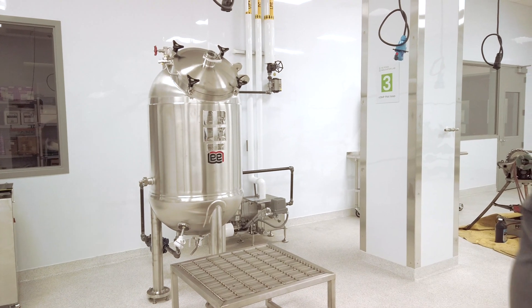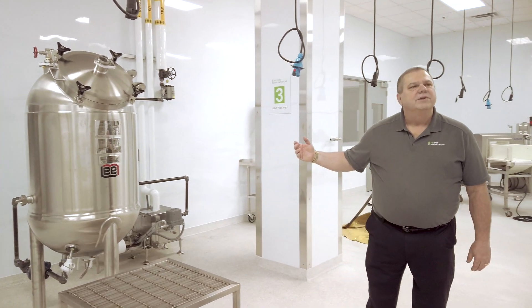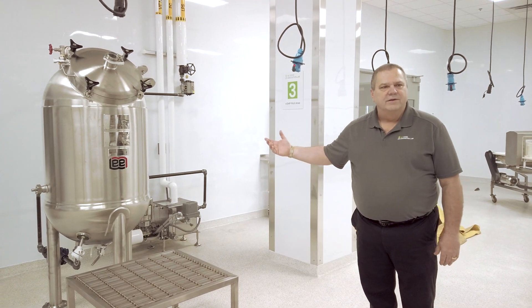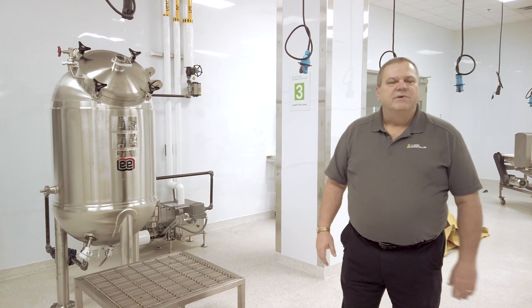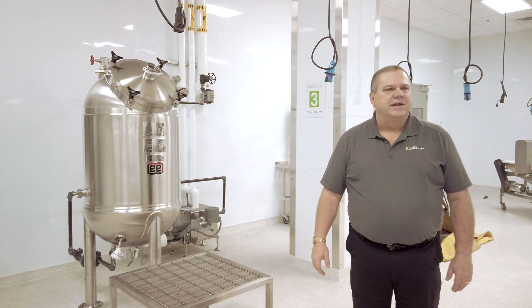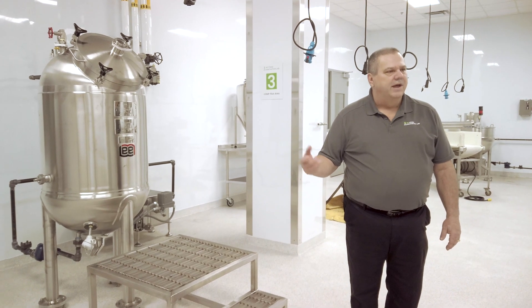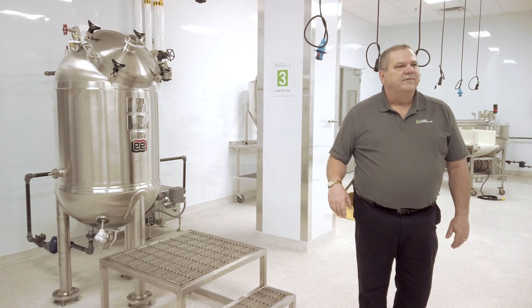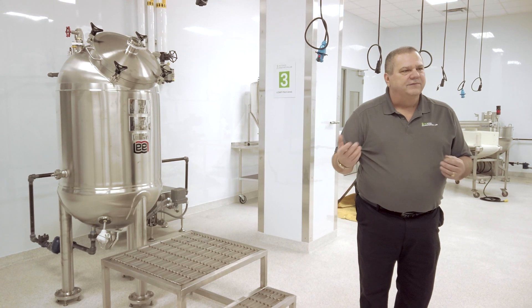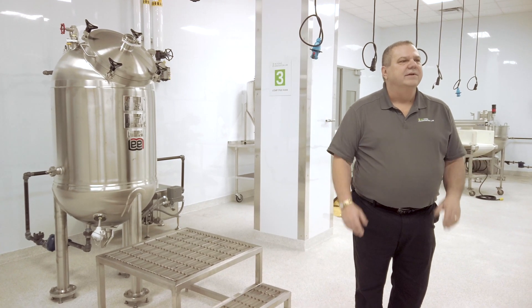Another piece of equipment we have in our facility is a 50-gallon vacuum pan processor, which allows us to do things like jams and jellies and condensed soups — it's a great way to remove water under vacuum. All products have to be packaged, and we have a number of different packaging configurations: a bag-and-box filler for half-gallon to three-gallon packages, a piston pump filler for viscous things like nut butters, frostings, and icings, a small powder machine for packets from one gram to 50 grams, and an auger filler that can fill a number of different bag configurations.